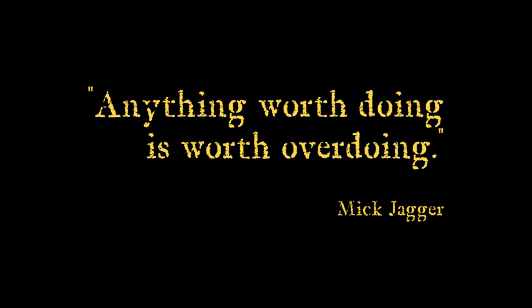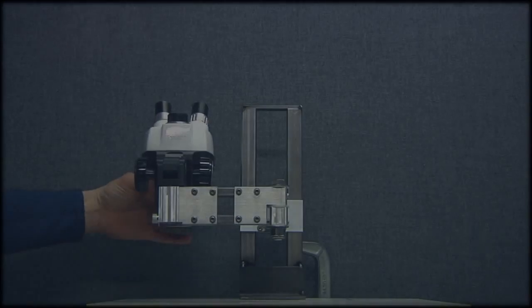Let's buy a stereo microscope on eBay without a stand, then I can build my own. How hard can it be, right?